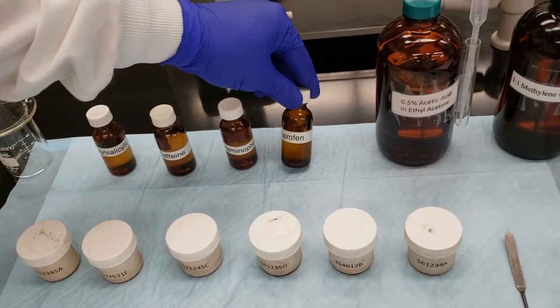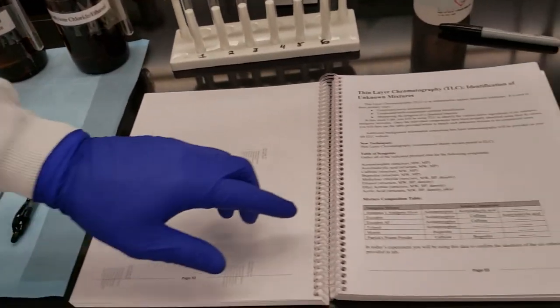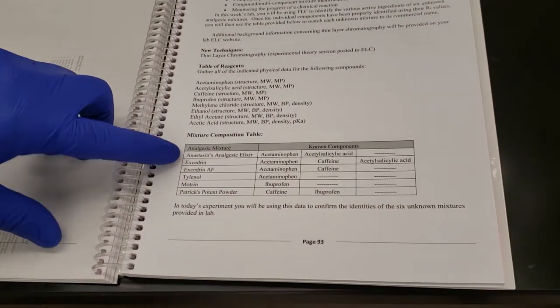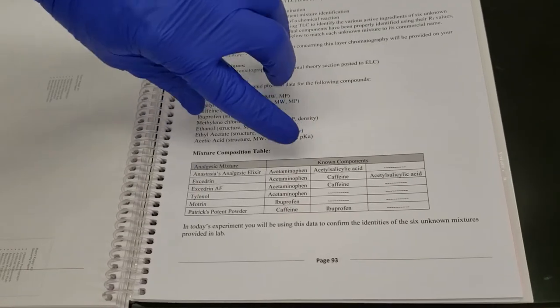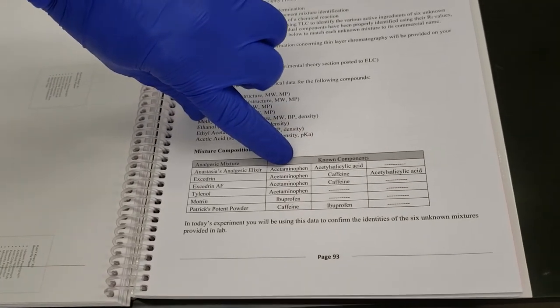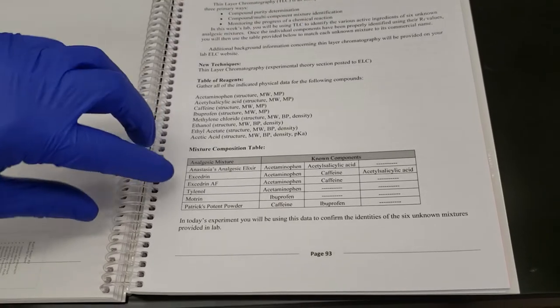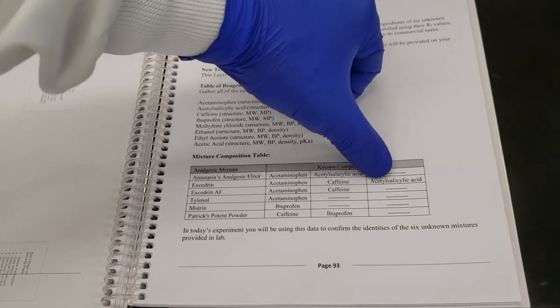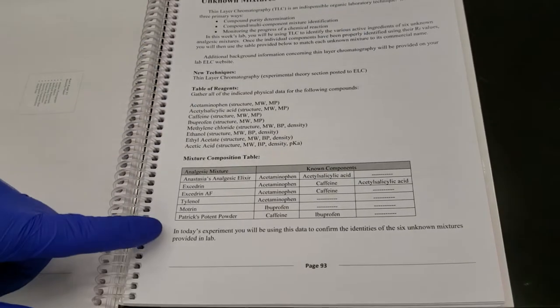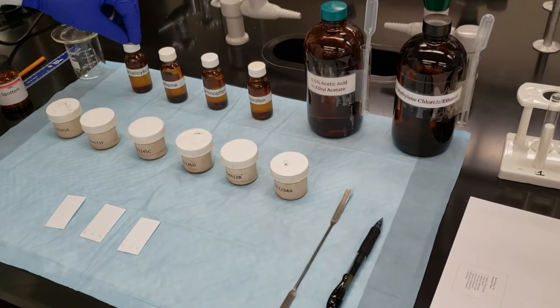and ibuprofen. And if we look at our composition table over here, we can see that each one of these mixtures, starting out with the first one, Anastasia's analgesic elixir, is composed of acetaminophen and acetyl salicylic acid. Excedrin, acetaminophen, caffeine, and acetyl salicylic acid, and so on and so forth. So these are the known active ingredients in these analgesic mixtures.